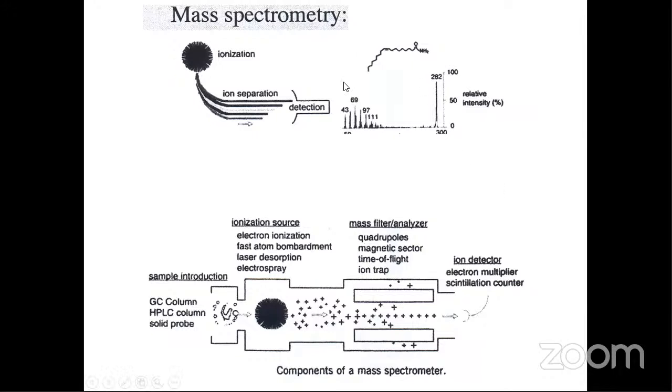So typically, you may get this type of mass spectrum here. Okay, so 280, here you get 282 as the largest peak. Here this is the long chain amide, with a C double bond. And then these are the various fragments that are happening. Generally, like I said, the amide bond breaks, so you can get a fragment. Sometimes a double bond breaks, so you will get fragments. So based on the fragmentation pattern, and if you know approximately what type of molecule it is, you'll be able to try to get the structure of the molecule actually.